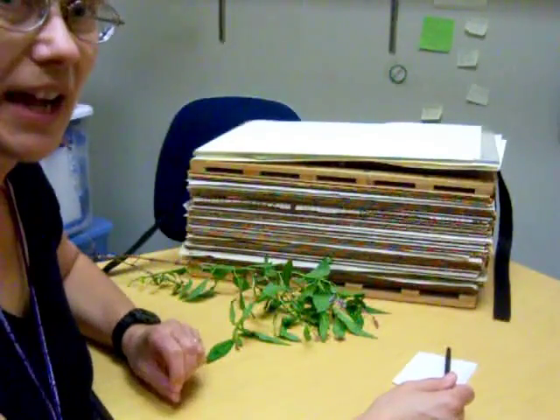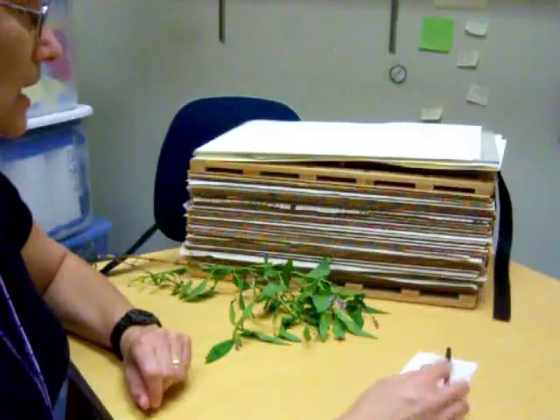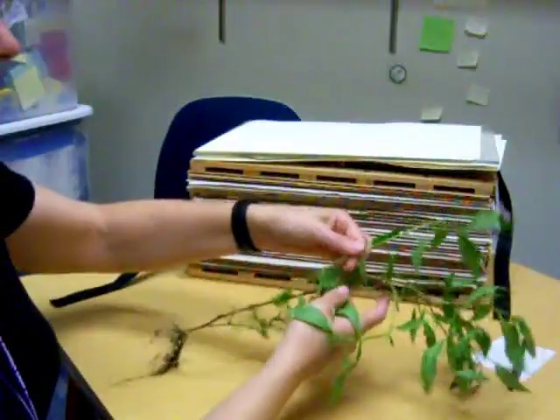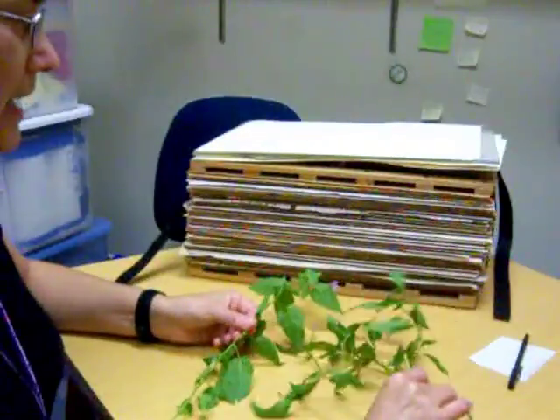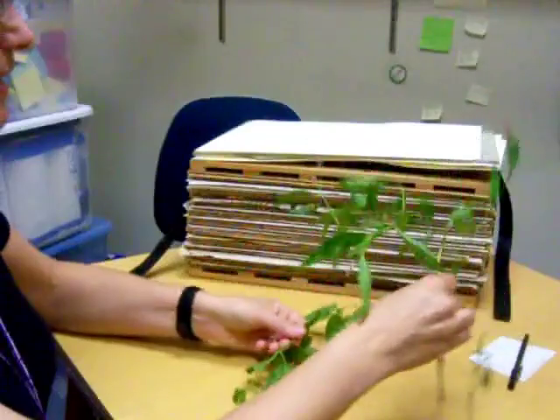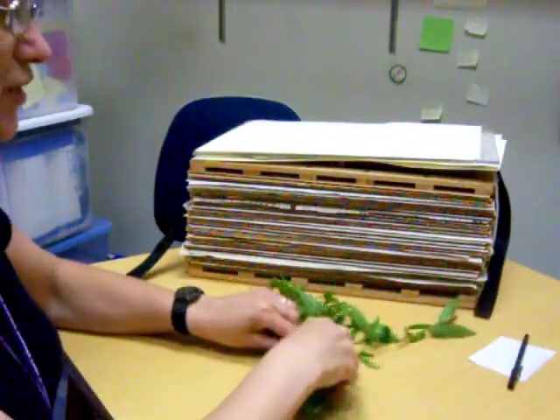I'm going to explain to you how you need to press a plant. I have two fine specimens here and we'll see how we would put these on a sheet to mount them.